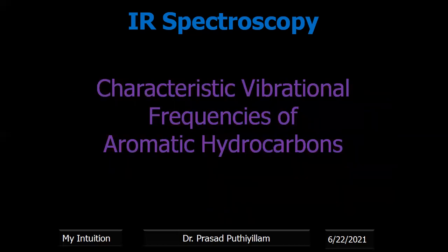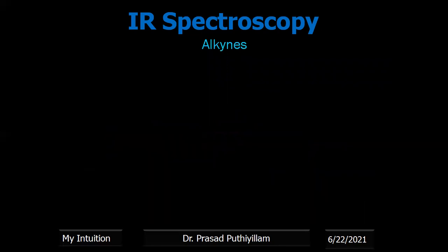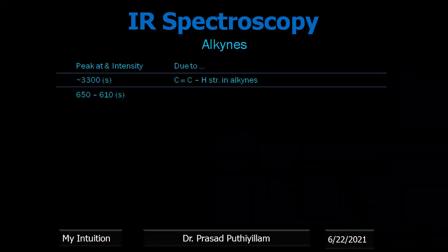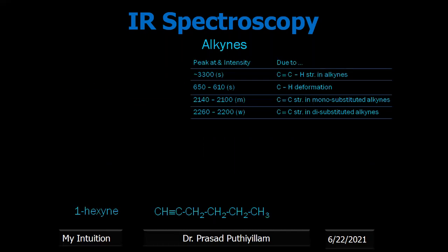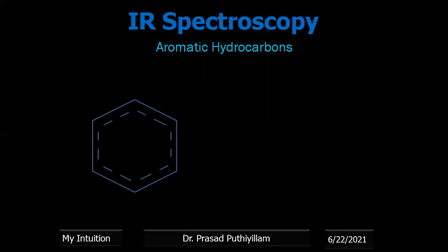Now some characteristic vibrational frequencies of aromatic hydrocarbons. The best example is benzene itself.